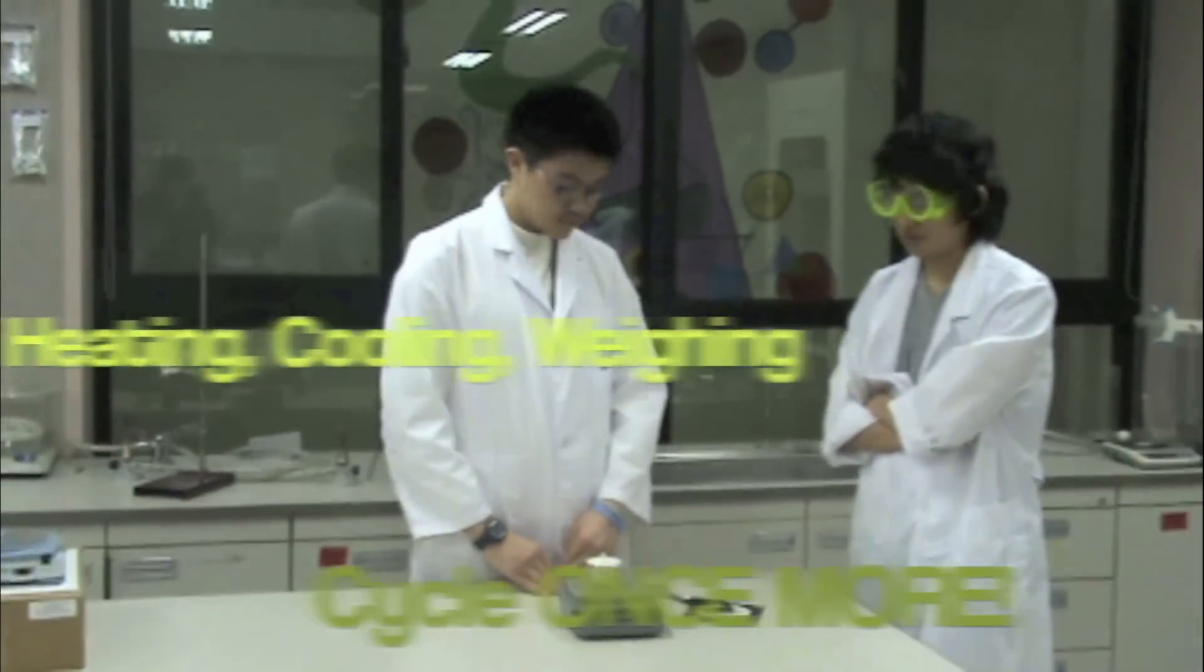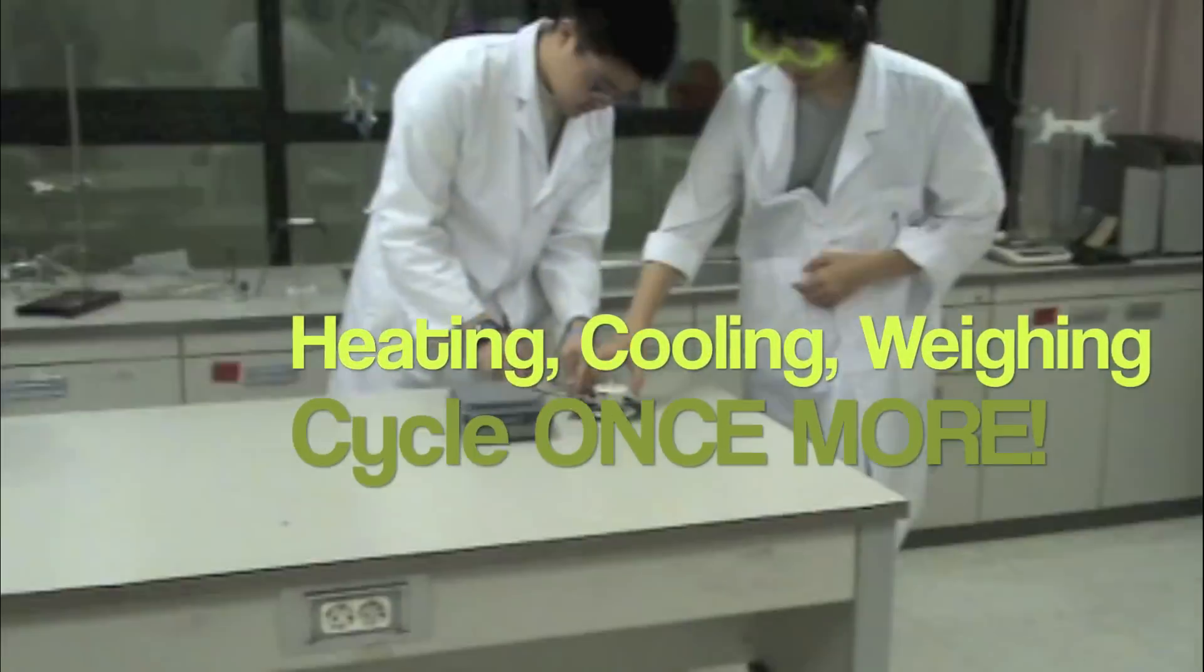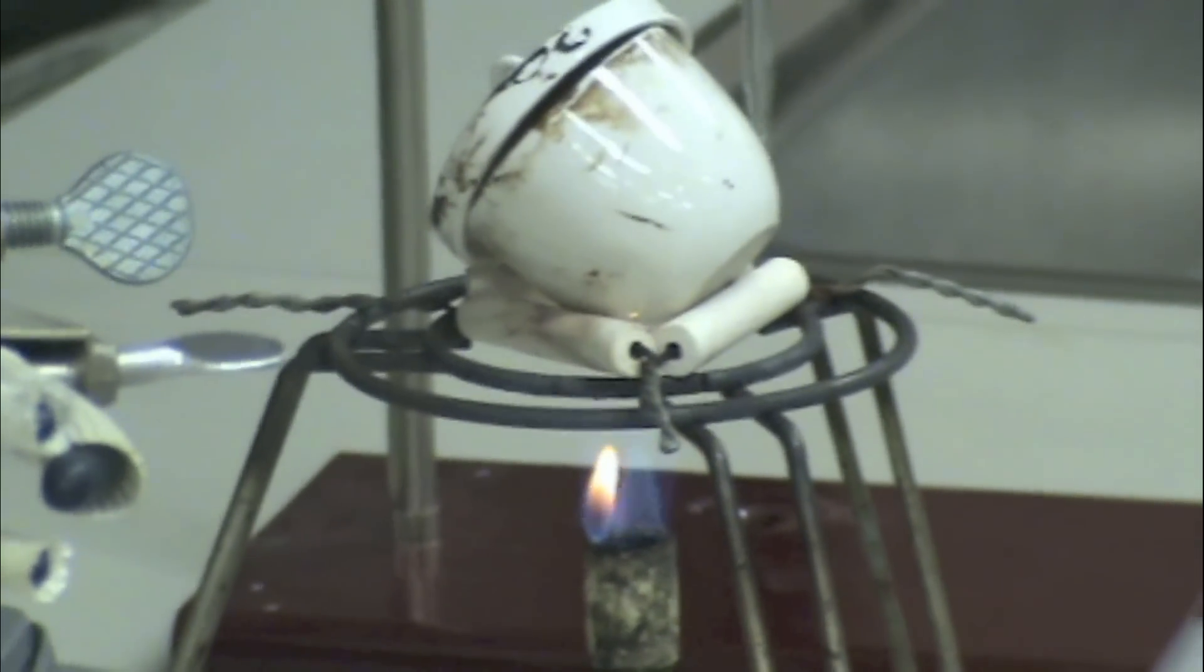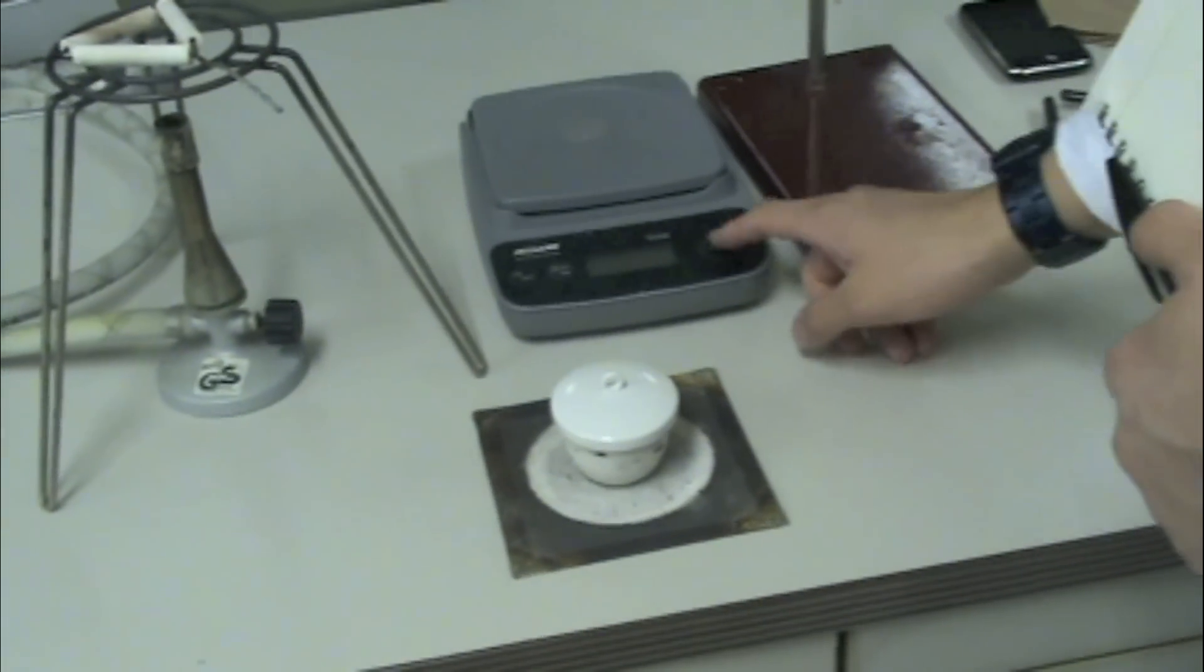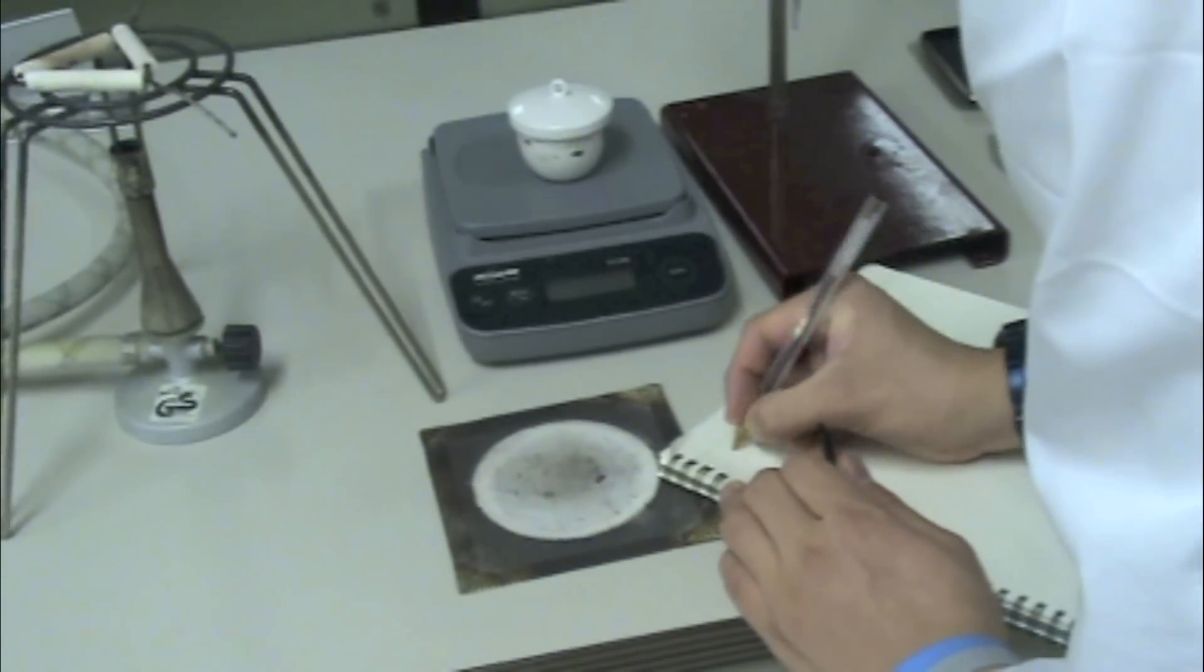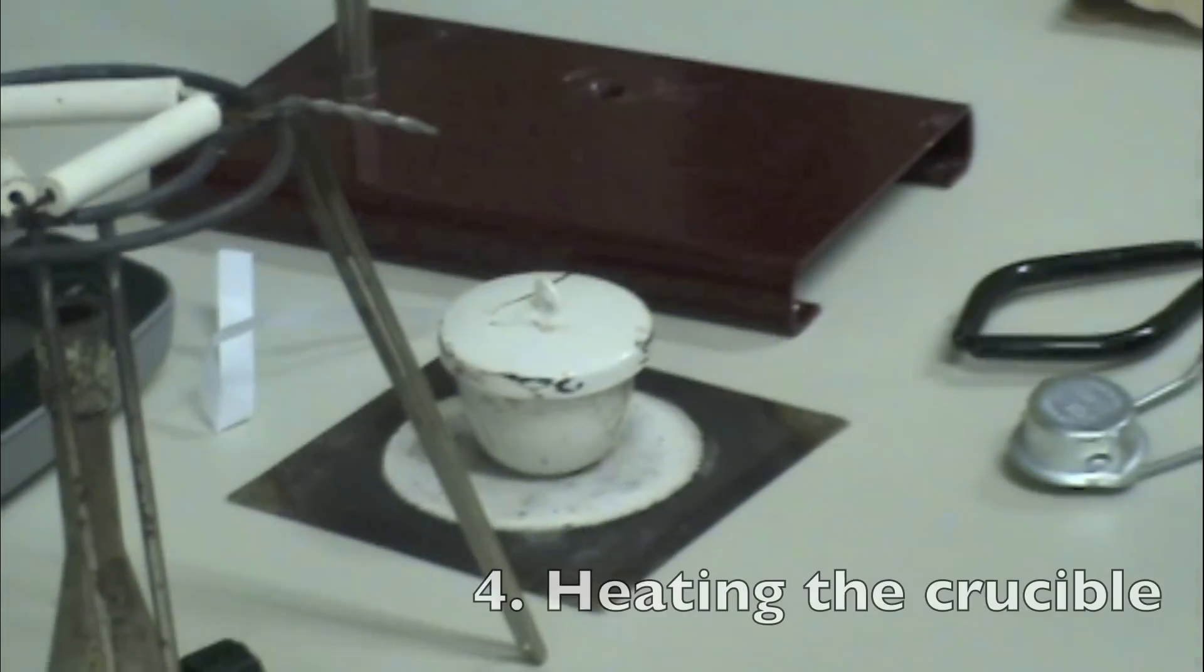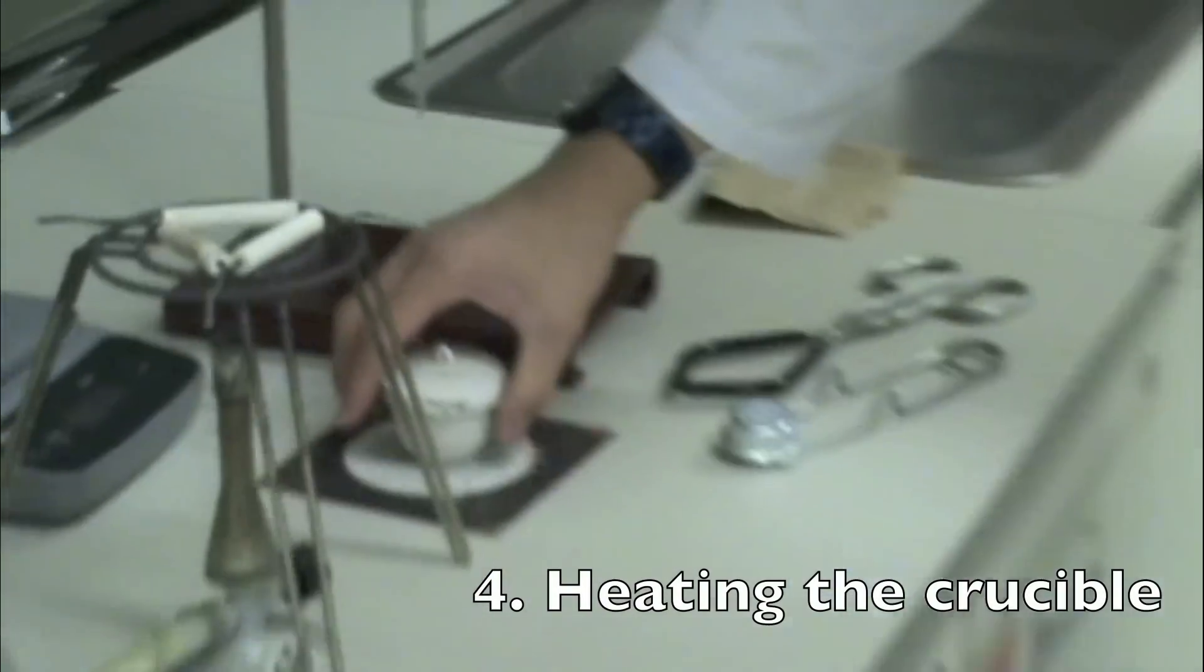Now, perform the heating, cooling, and weighing cycle once more, and compare the two weight measurements. If the two weight measurements are equal, you are good to go. Place the sample you want to heat inside the crucible and weigh the crucible, lid, and the sample together to get the total weight. Now it's time to do the actual experiment.